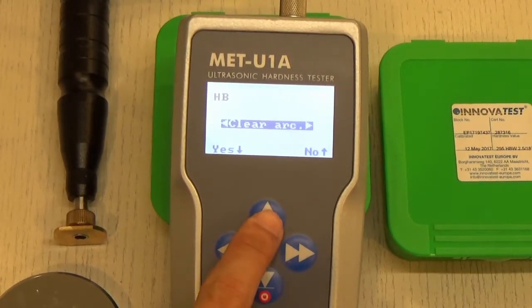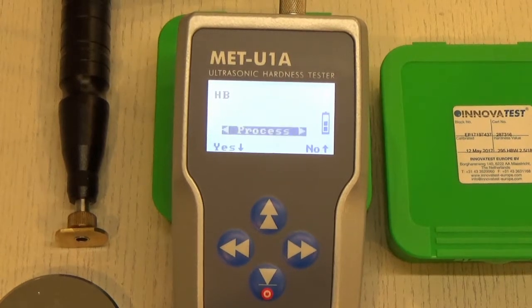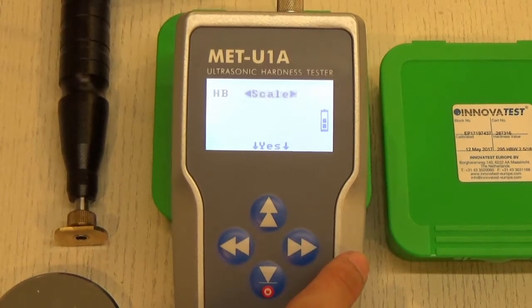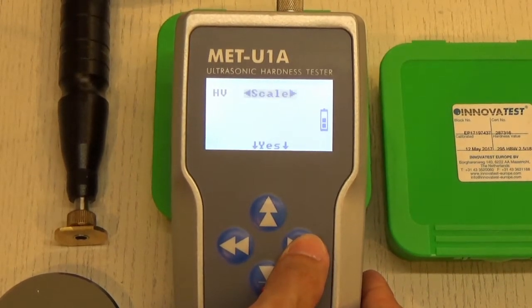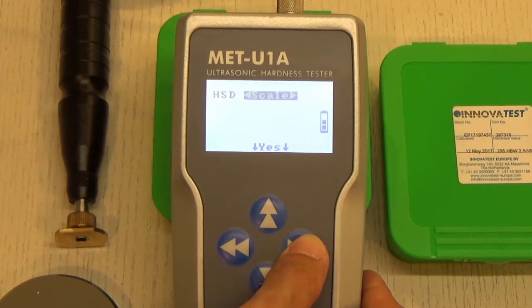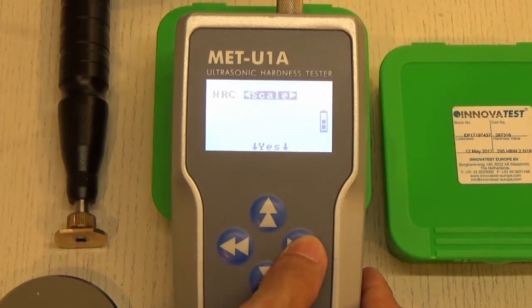To go back, press up. To change the scale, press up from anywhere in the settings menu, then press the right button to cycle through different scales such as HV for Vickers, HSD for Shore D scale, RM for tensile strength, and three user-defined scales from H1 all the way to H3.